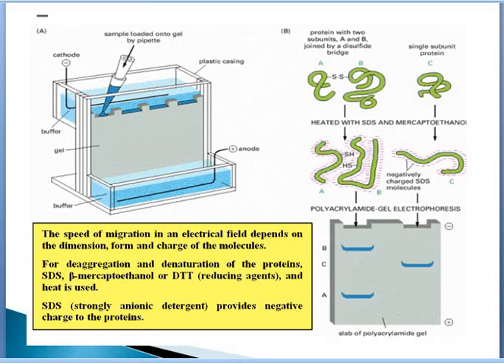When we talk about the components of the SDS PAGE electrophoresis system, it includes the buffer tank, lid with the power cables, electrode assembly, cell buffer, then casting stand, casting frame, comb, spacer arm, etc. The thickness of the gel will be decided based on the placing of the spacer arm.